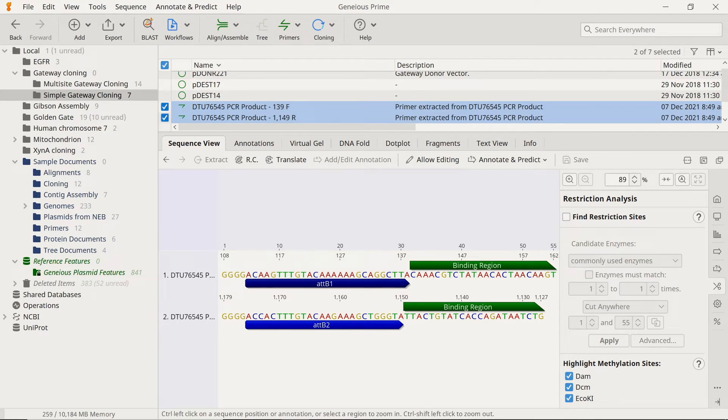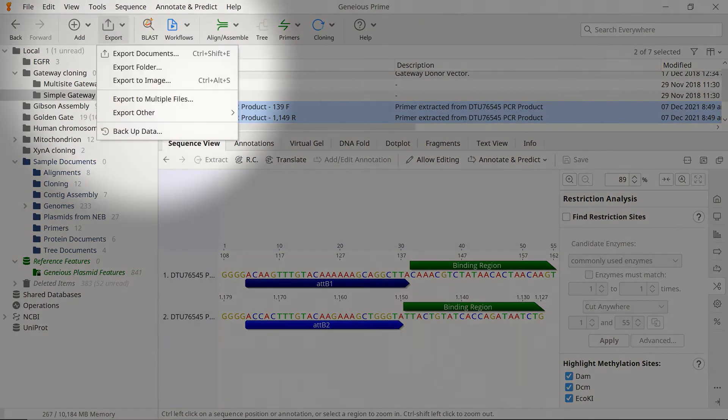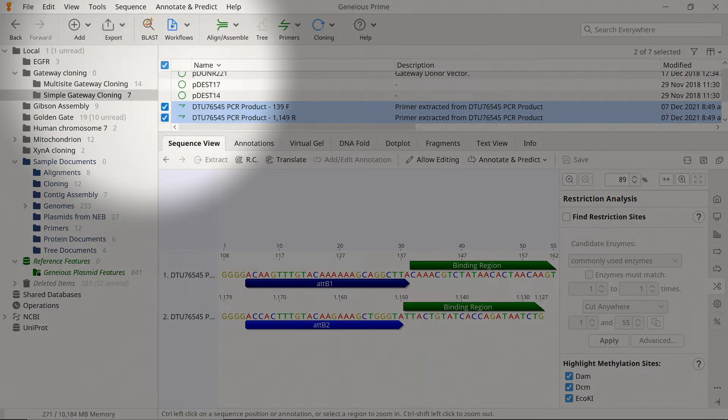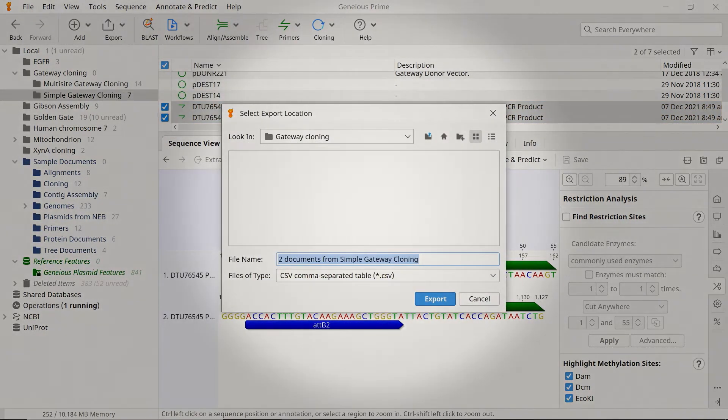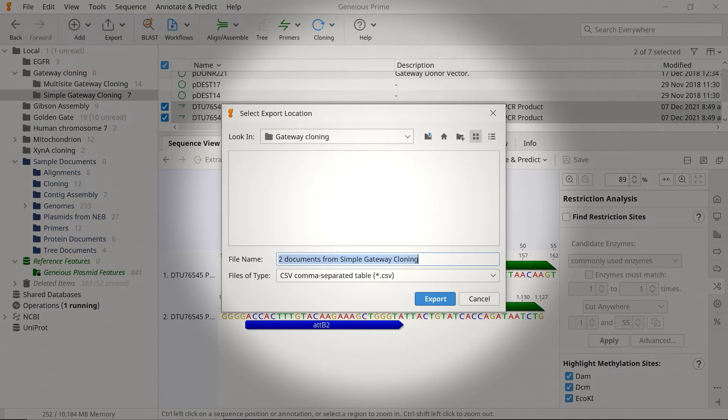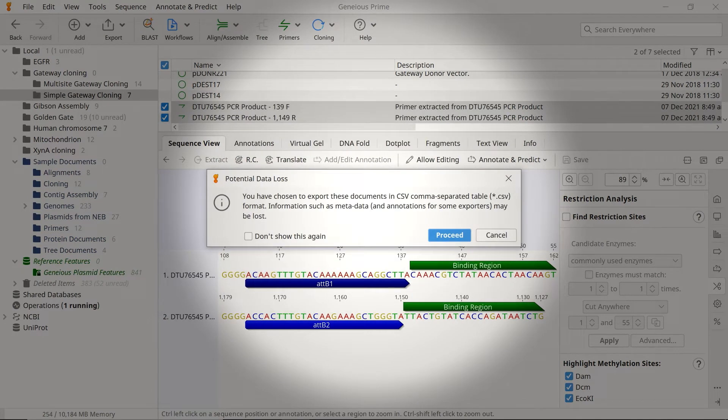The exported sequences will appear as separate primer files in the document table. To export these files, select Export, and choose Export Documents. For example, if you save the sequences in a CSV file, you can refer to them when you order the primers.